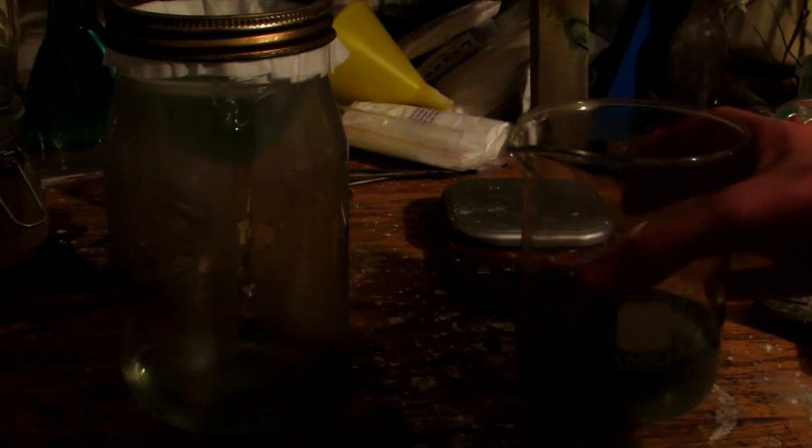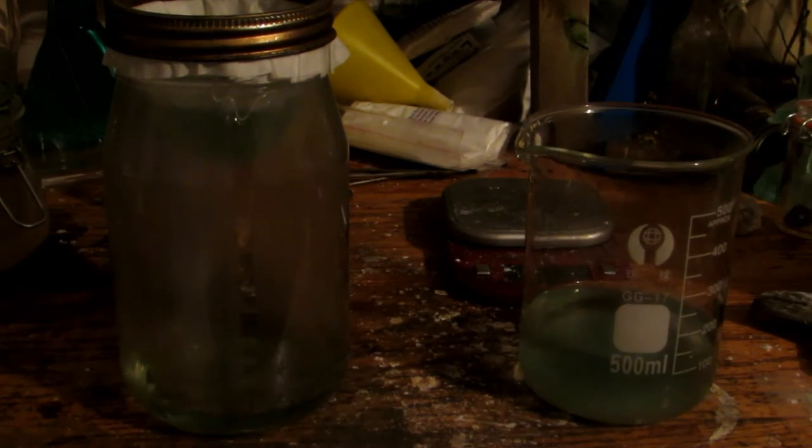A simple filtration will get rid of all that unwanted silicon dioxide, and we'll be left with our solution which we can re-boil down to get the crystals. You can see it is a rather prominent green color due to iron impurities. So I'll filter everything and then be back.